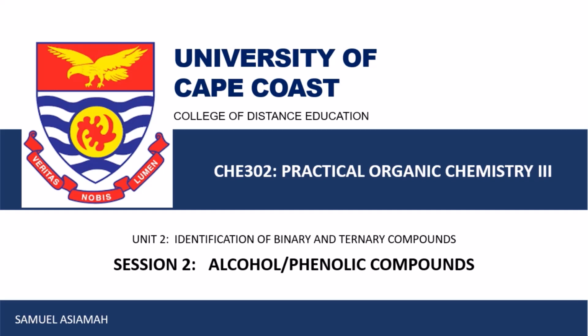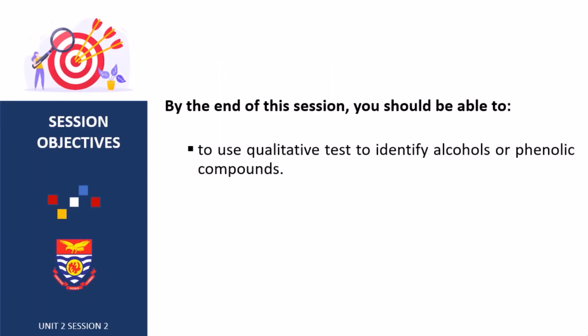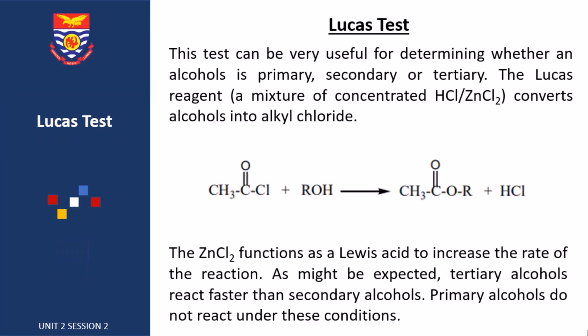Welcome to the second session under Unit 2, which is on alcohols and phenolic compounds. At the end of the session, you should be able to use qualitative tests to identify alcohols or phenolic compounds. There are quite a number of qualitative tests you'll be looking at.